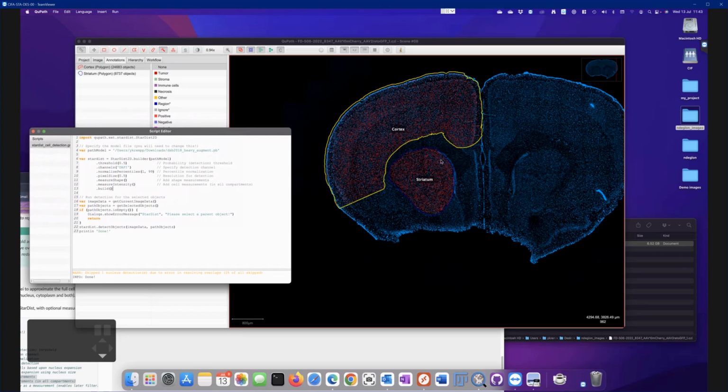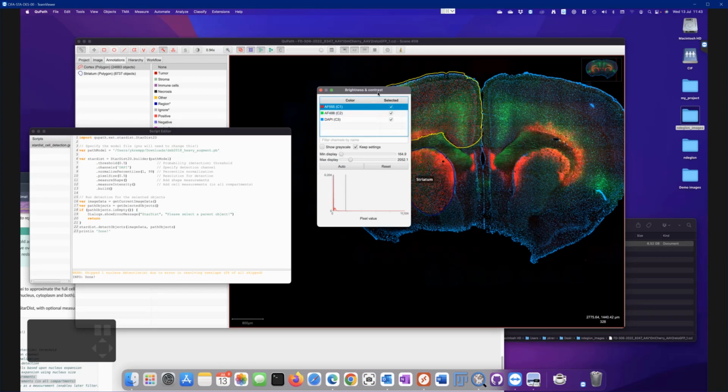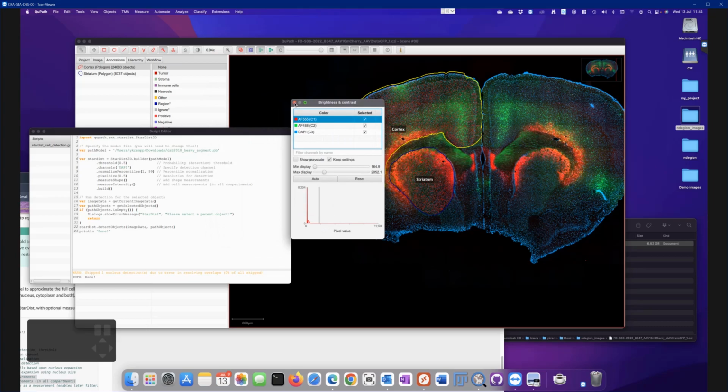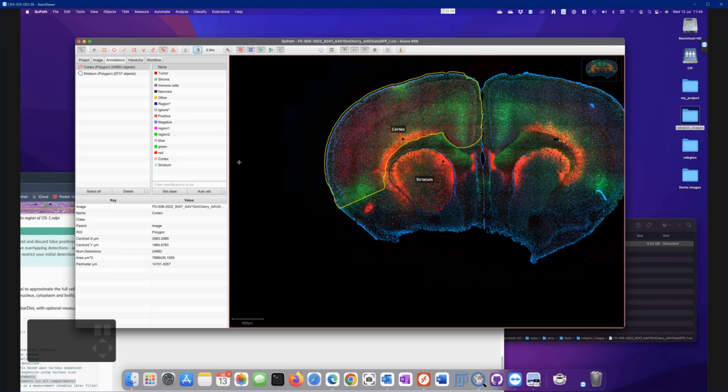The next step is to classify them, because as a reminder, we have 3 colors here. And we want to classify cells whether they have some blue signal or some green signal or some red signal. So in order to do that properly, we will have to just close those windows here, to do a bit of preparation.